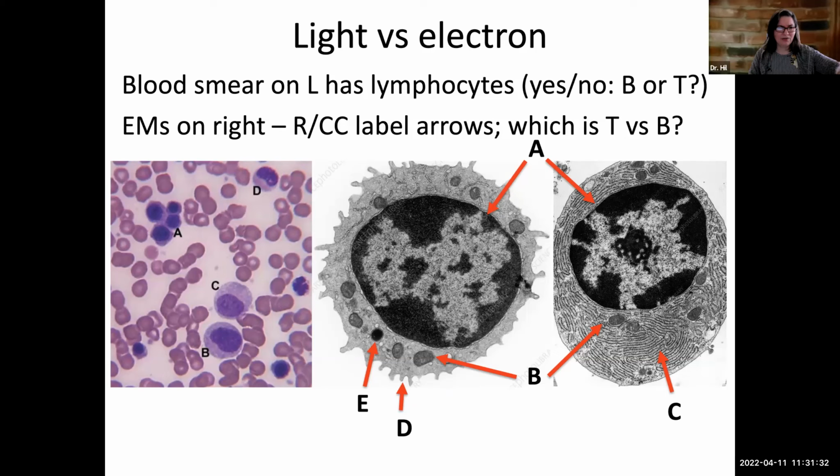Yeah. So Golgi is not a bad guess. Some of it is Golgi. Some of it is smooth ER. Some of it is ribosomes. They're all connected in a system, the major component of which is the endoplasmic reticulum. Remember that? That kind of looks like this. The endoplasmic reticulum is part of a system that generates proteins, but doesn't generate all the proteins in the cell. It just generates the ones that are going to go to the membrane or that are going to leave the cell. Does that give you a hint as to which cell type this might be?